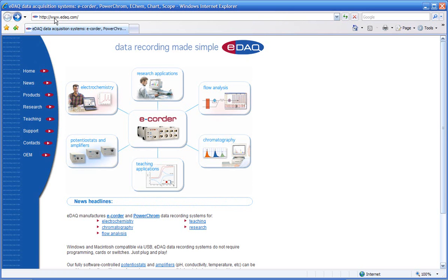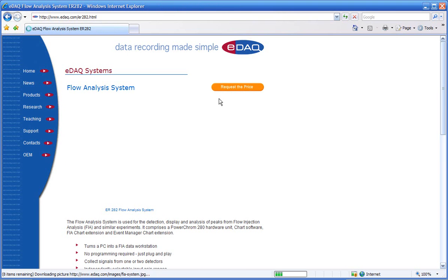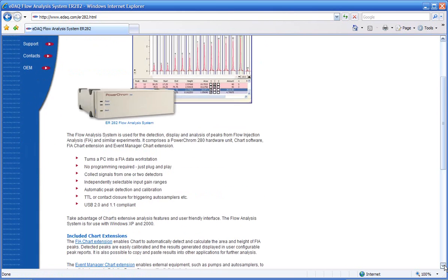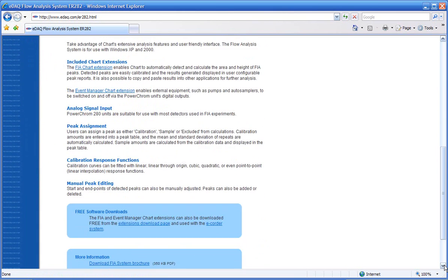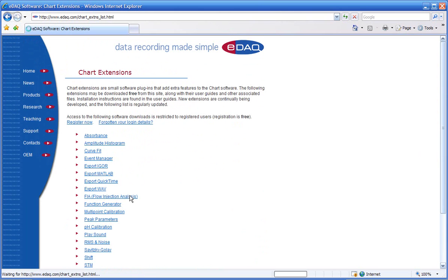If you go to www.edaq.com, click on the flow analysis section. If we move down, we can see we can download this extension from the chart extension download page. It's here.